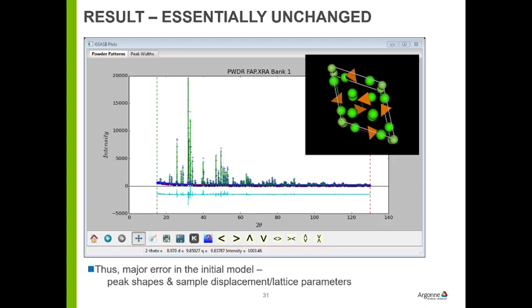You never get it completely right. Peter Stevens had the line which I like most about this. A Rietveld refinement is never finished. It's merely abandoned because you just run out of stuff to do. Okay, and so when you're done, you can admire that, and then you can draw a little picture of the crystal structure with polyhedra for the phosphates. And one set of these things is the fluorine, and the other one's the sodium, I guess it is, or whatever it is, calcium.